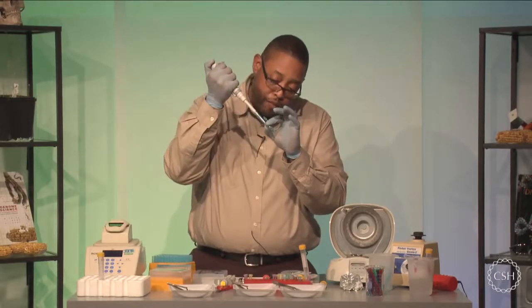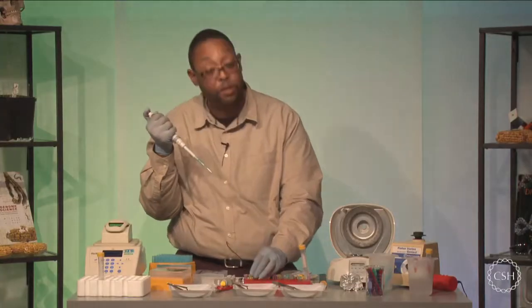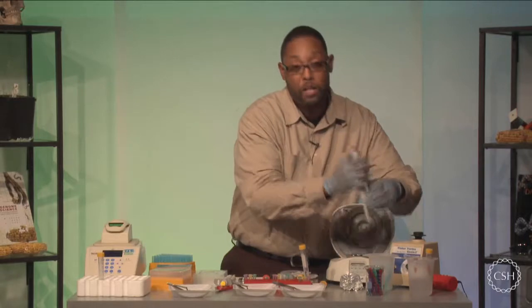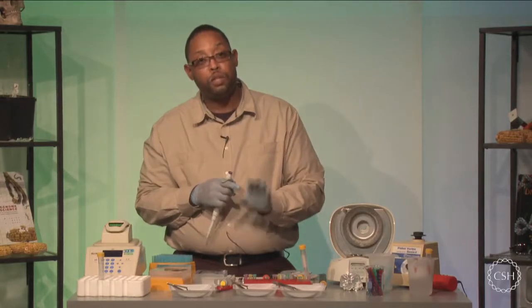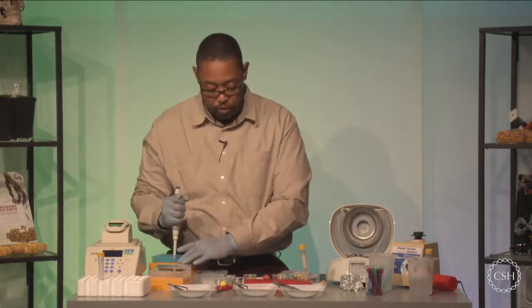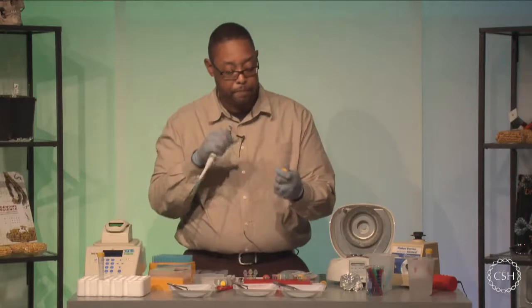Now, since this is the first wash, if you see that there's a little bit of liquid left over, that's okay. I'm not worried about 10 microliters of liquid in this first wash. However, in the second wash, when I go to remove it, I want to make sure I get everything off, and we'll talk more about that as we get there. But don't worry about it after the first wash. We're going to add another round of wash buffer to this at a volume of 500 microliters for a second wash to make sure that we're cleaning our silica resin pellet nice and easy.